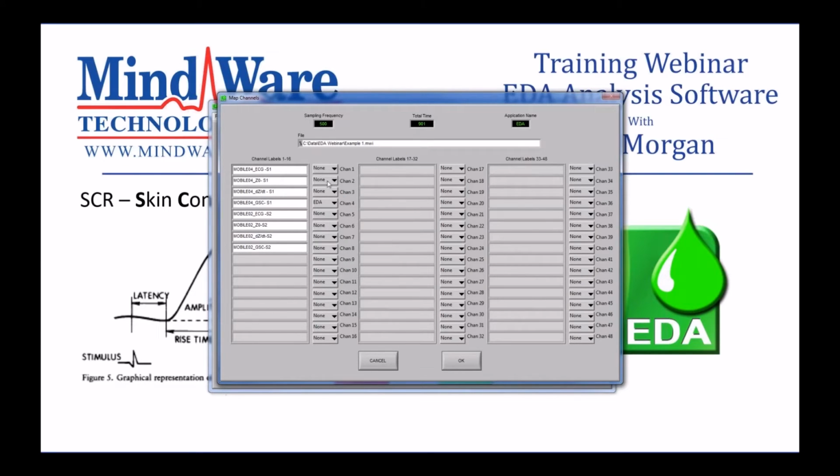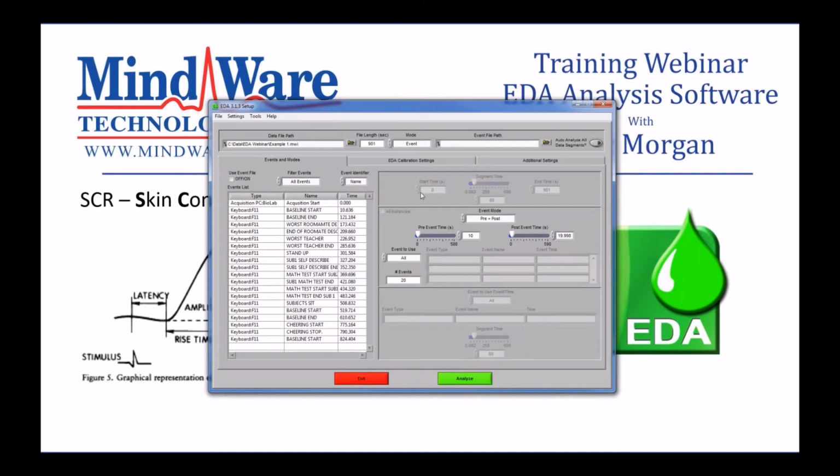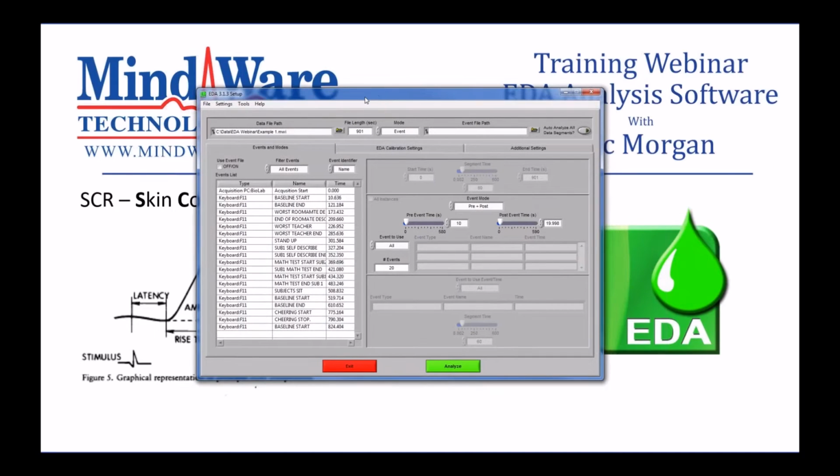I'm also going to map my impedance channels because respiration can be used in the EDA application to help us with some artifact detection and editing. So I'm going to map those two channels and press OK. And now we're on our setup screen. So some of this I'm going to go through fairly quickly because it doesn't pertain directly to EDA. And the second tab is what we're really going to focus on.